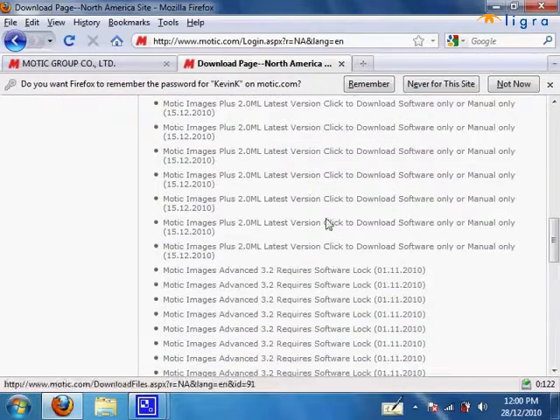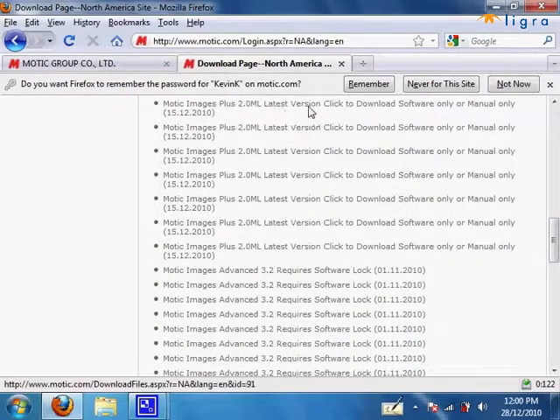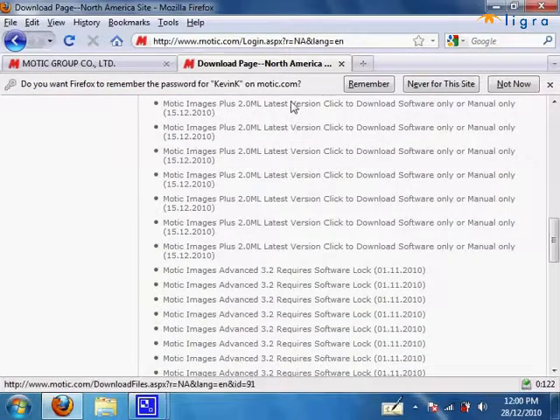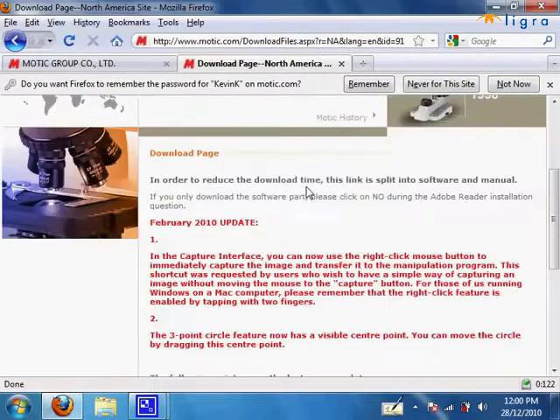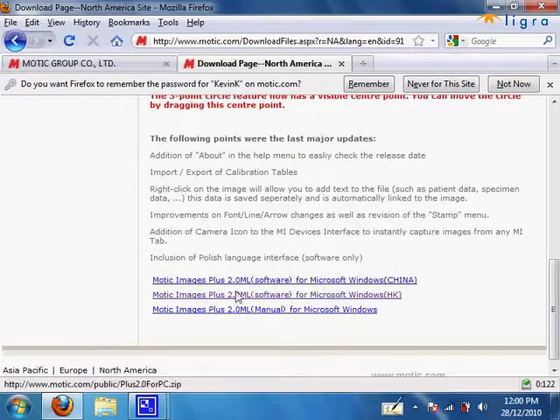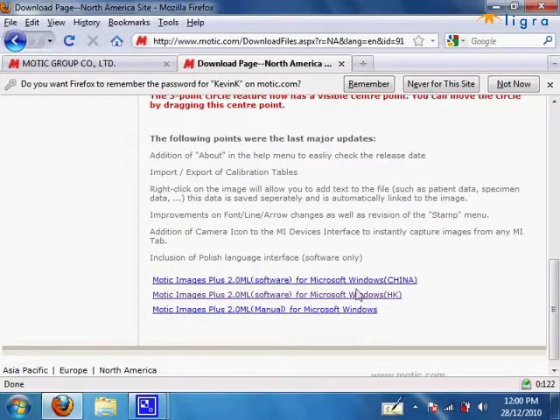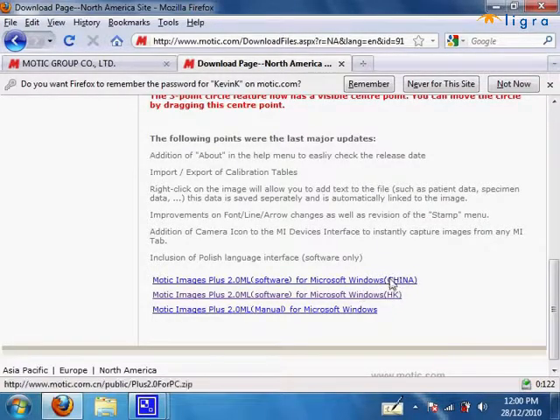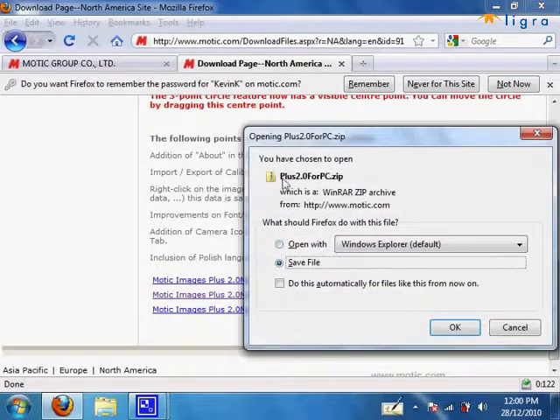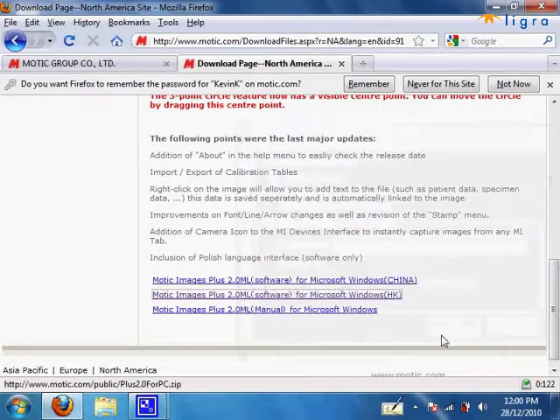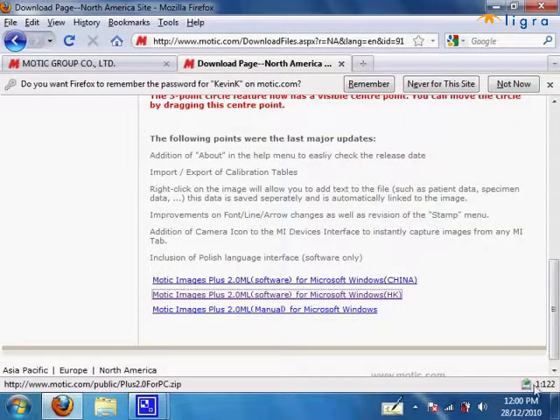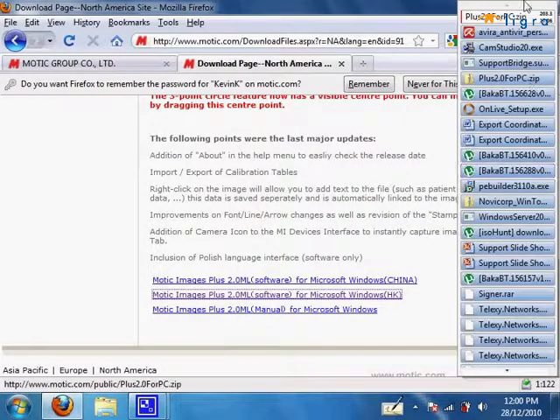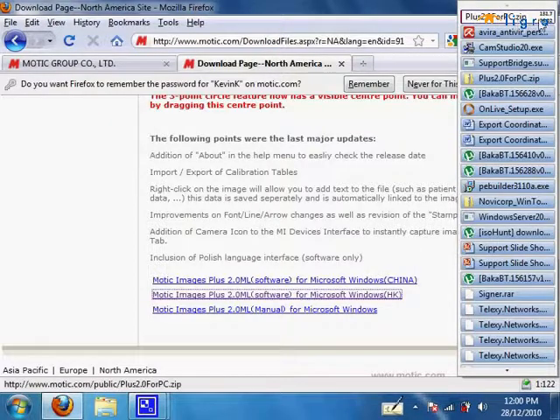And it should pop up the download page again. The one we want is Motic Images Plus 2.0 latest version. Once we get to this page, click on the one that has a bracket at the end. The China one is another mirror but it's a bit slower, so we'll go with the HK one. Once you get here, save the file to your desktop if possible. As you can see now, it's downloading Plus 2.0 for PC.zip.